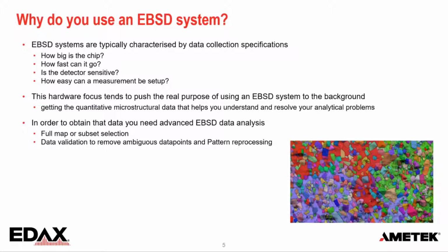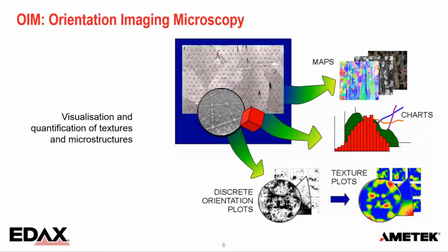Another very important feature, data validation. How are we certain that certain points are indexed correctly? Can we trust the data points? Once you've done your analysis, once you've set everything up and you have a repeated analysis, maybe tomorrow you have to do a similar sample and you don't want to redo everything, you can create templates and automate your analysis to save time. It's also very, very flexible. We have interactive analysis, and I will show you a little bit more about that later on.